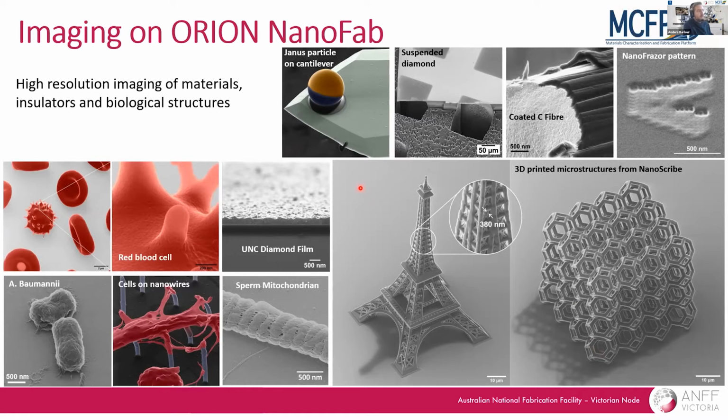The examples I'm giving you here today are just a few of the ANFF related and fabrication related work that we are doing. So we have some cantilevers that are functionalized, work with diamond. We do lots of work looking at biological structures here. Again, a thin diamond film, and more recently, some very gorgeous work coming out of MCN and the Nanoscribe. These are incredibly finely printed polymers on glass slides. This is showing the Eiffel Tower with the features here less than 400 nanometers in size coming out of that technique. And just a reminder, all of these are generally insulating materials, and we can get these gorgeous images without needing that extra gold coating step.